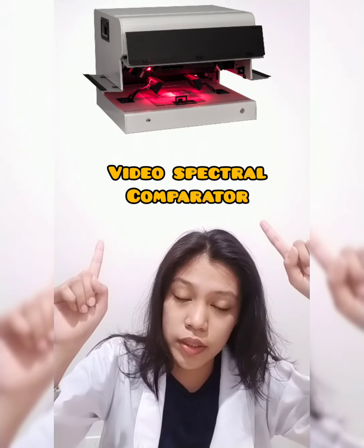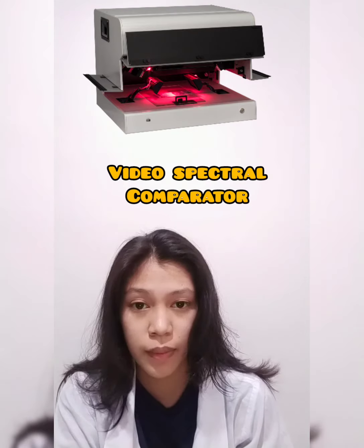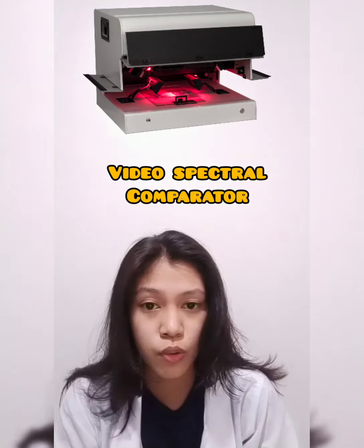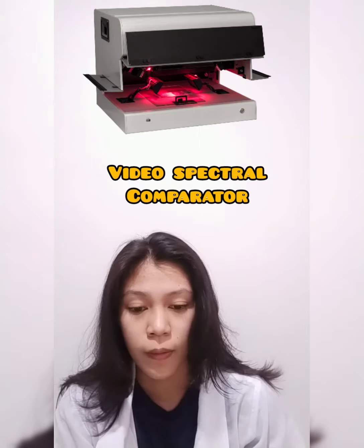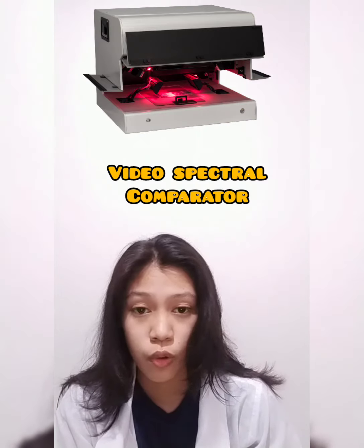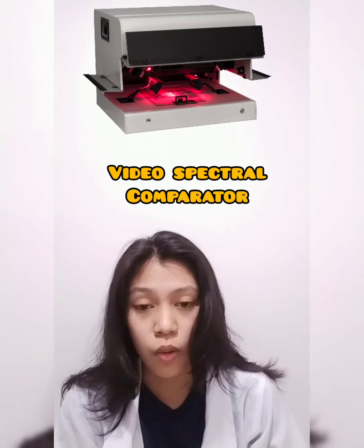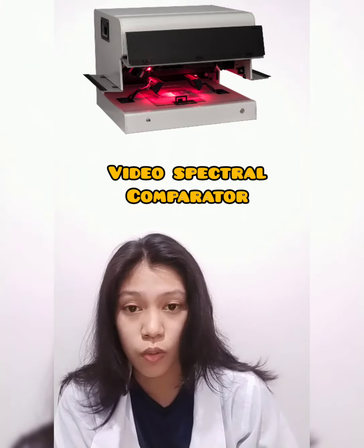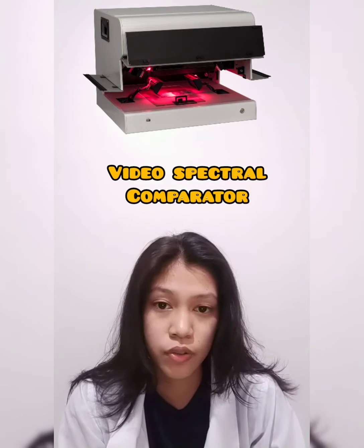For the last instrument, this is the video spectral comparator. This machine utilizes many functions and uses different light sources to examine a document. It is also used as a forensic tool to check the validity of a valuable document, and to compare one set of images or spectra against another. The VSC also has a variety of uses in the cultural heritage sector, like analyzing ink or looking for deterioration in documents. Those are the instruments which are commonly used in questioned document examination.